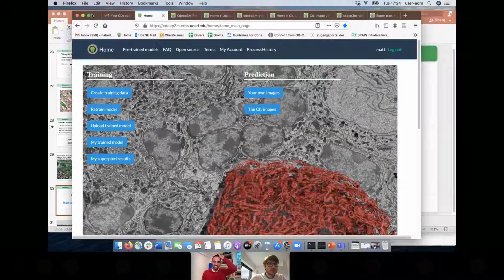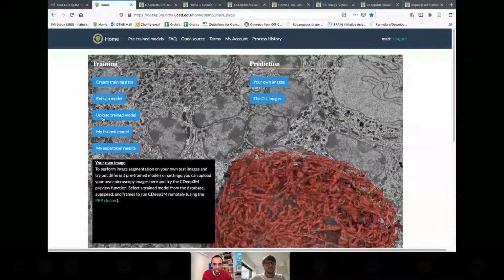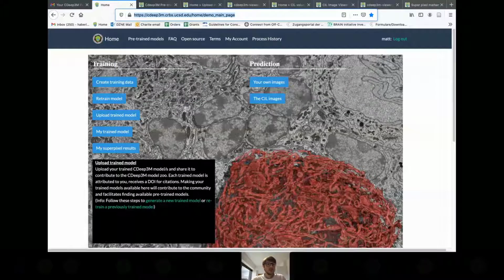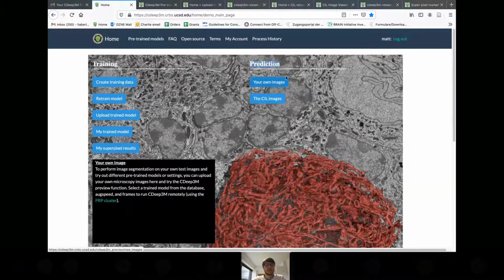So I hope you can see my screen. Okay, so this is the landing page when you come to our online platform. On the left-hand side, you see what's going on with training. On the right-hand side, you see what's going on with prediction. These are the rough categories.